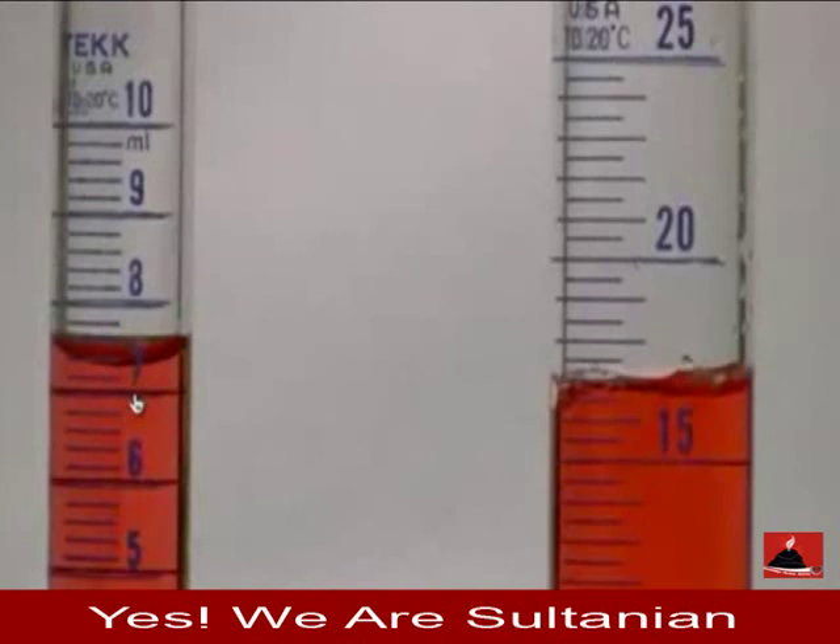Now let's look at the graduated cylinder on the right. Here we have 15 milliliters, and each hash represents 1 milliliter. So if this is 15, this one is 16, then 17, 18, 19, 20. And the ones in the middle are 0.5 milliliter marks. So if this is 15, this is 15.5, then 16, then 16.5, and up here would be 17.